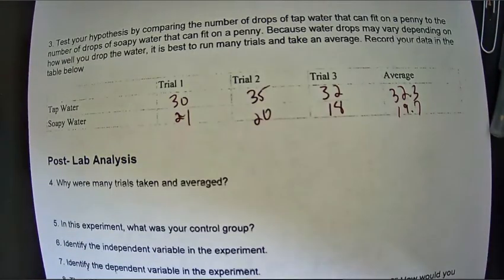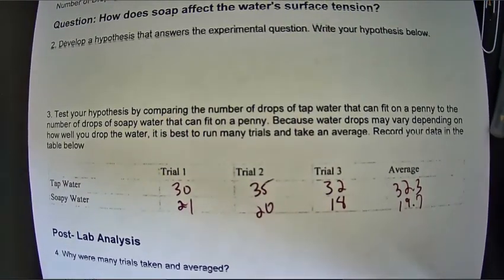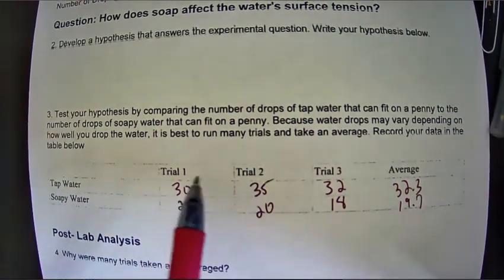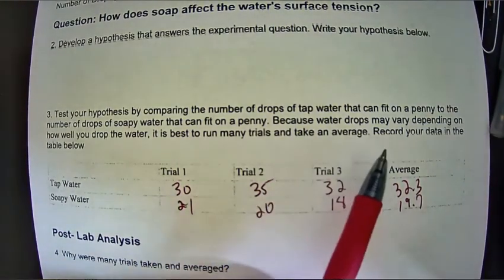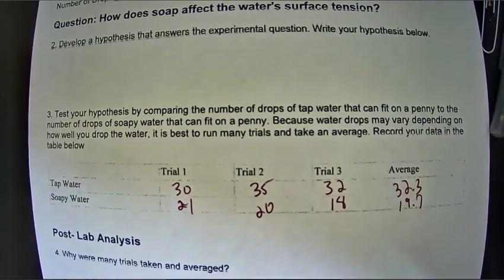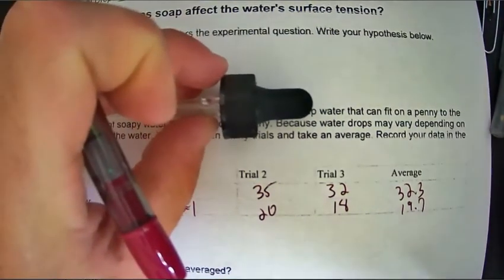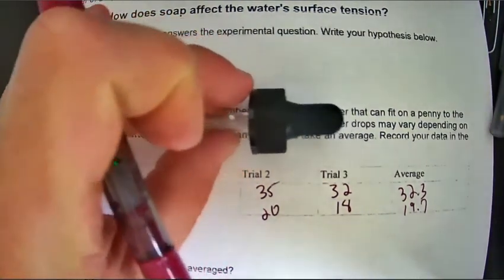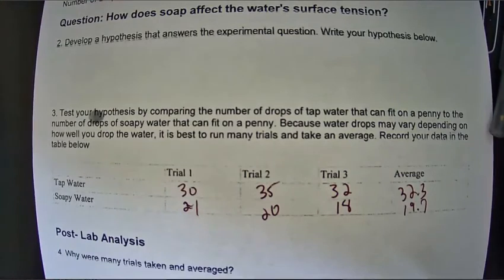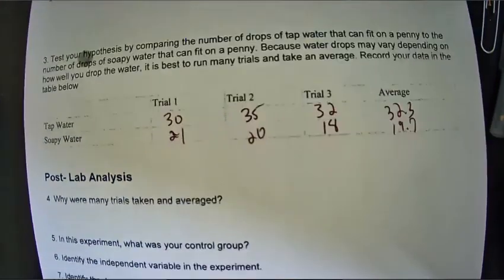So, why were many trials taken and averaged? Well, you can see that there was some variety between those. There's a little bit of change. And it also tells you up here, because water drops may vary depending on how well you drop the water, how hard I would squeeze the bulb on the eyedropper, for example. Sometimes you might get bigger drops and smaller drops, so it's good to do a couple trials to eliminate any of those differences. But for these, they're actually pretty consistent, I think.